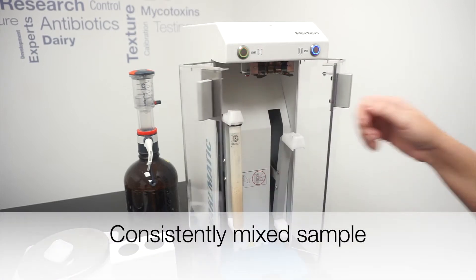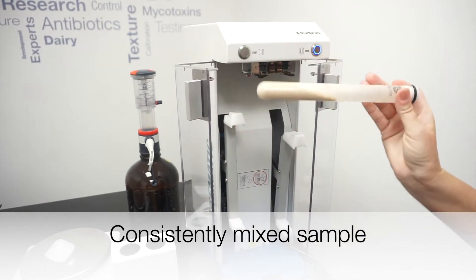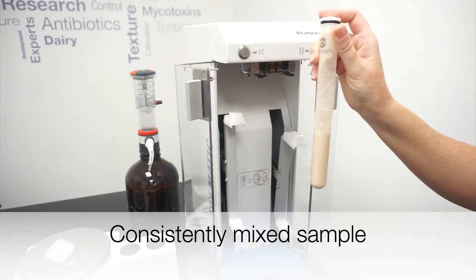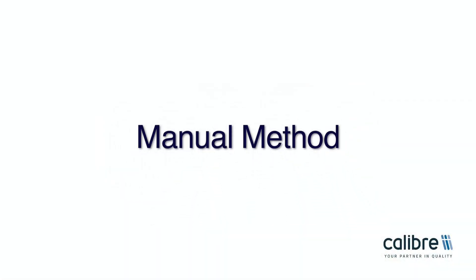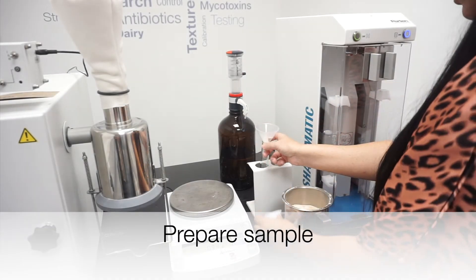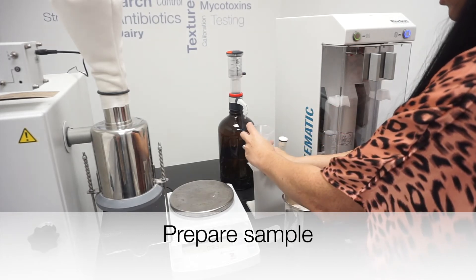As you can see, the Shakematic will accept two tubes so samples can be mixed simultaneously, or, in the case of this demonstration, individually.